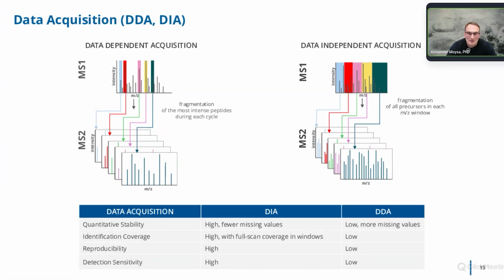At the beginning of mass spectrometry-based proteomics, data-dependent acquisition was the primary approach for data collection. However, data-dependent acquisition has several limitations due to its reliance on ion intensity and inability to capture all ions. Today, data-independent acquisition is widely used, offering advantages such as fewer missing data and better reproducibility. While data-independent acquisition requires more complex data analysis due to the multiple fragmentation spectra in a single acquisition, current technologies allow for efficient processing of this data.